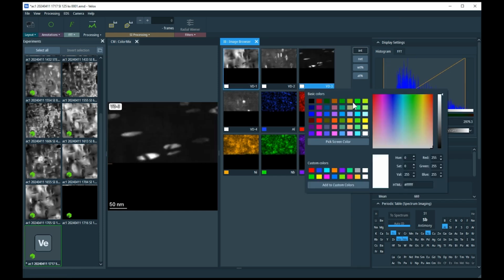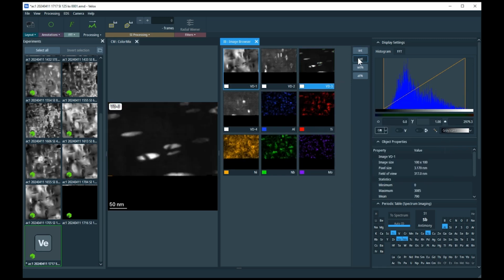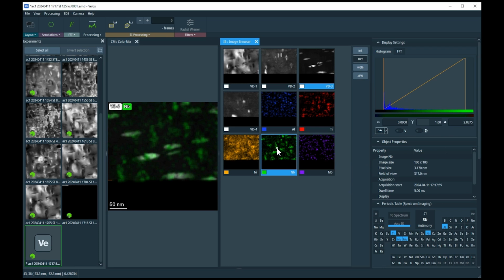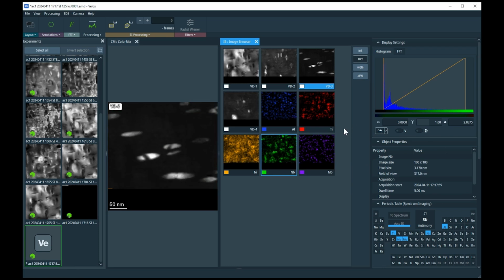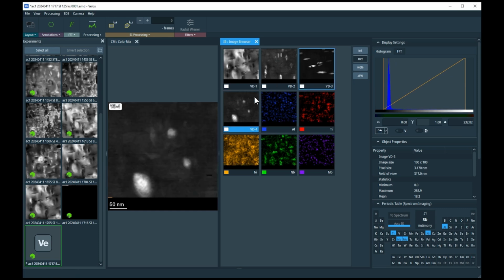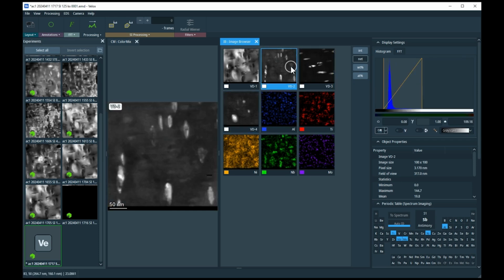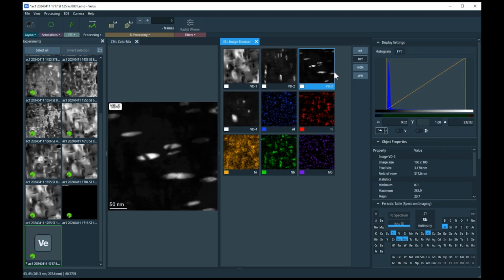We can work with the virtual STEM phase maps in the same way we work with EDS maps, and can change the colors if you like. Velox allows live EDS quantification during acquisition, so we can activate net intensity mode, which applies background correction and peak deconvolution to the spectral data from each of the 4 detectors. This really enhances the elemental maps for titanium and niobium in the sample, and we can further improve quantification through absorption correction and pre-filtering once the acquisition is complete.